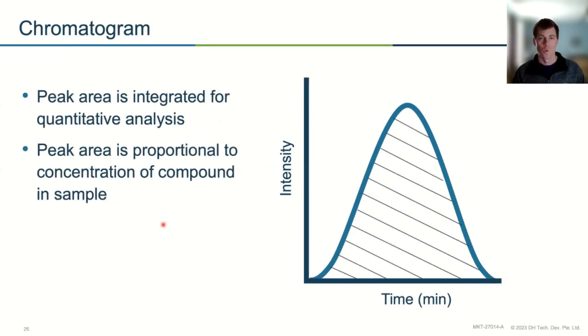And when you do want to do your quantitative analysis, you can integrate the area under that peak. If you come from a quantitative background, you know exactly what I'm talking about. You can build a standard curve. You can compare fold change, all by integrating that peak.